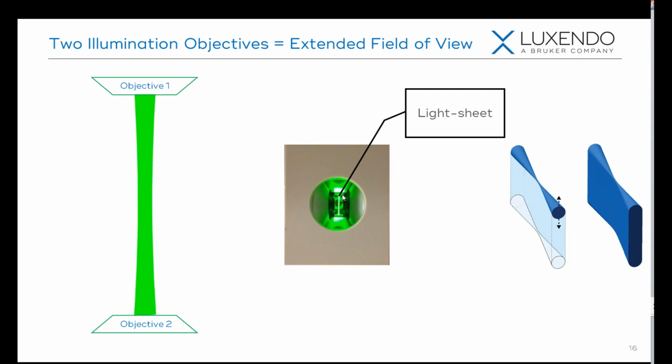And right here in the center, underneath that light sheet, what we can see is our sample holder. Now with this 4-objective geometry, our sample holder is going to be a 4-dimensional stage. So the stage is going to move in X, Y, Z, and also be able to rotate. And this is very advantageous for samples because it allows us to rotate and position this in whatever orientation is optimal for your experiment.